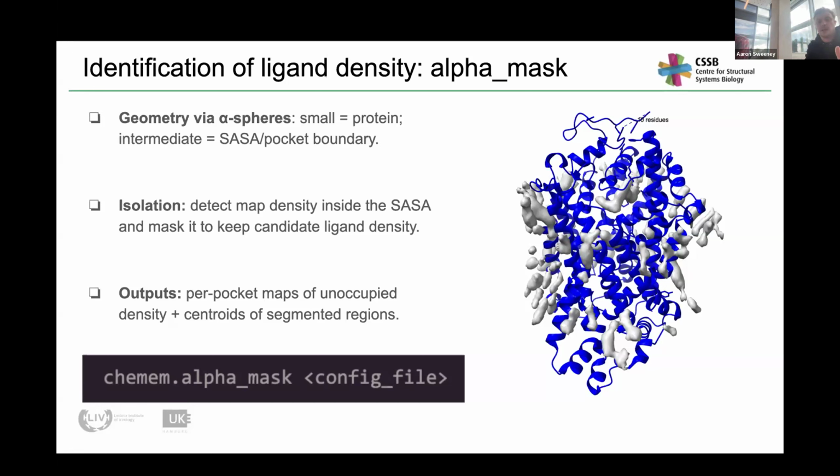And for each iteration, you'll get a solution, and then it will rank these solutions. And usually the correct one is within like the top 10% of solutions. And what I found with this situation was that a lot of the higher up solutions I got were for the preferred conformation. And as I started to move down and down the list, there were some that were trying to fit to this kind of alternate conformation.